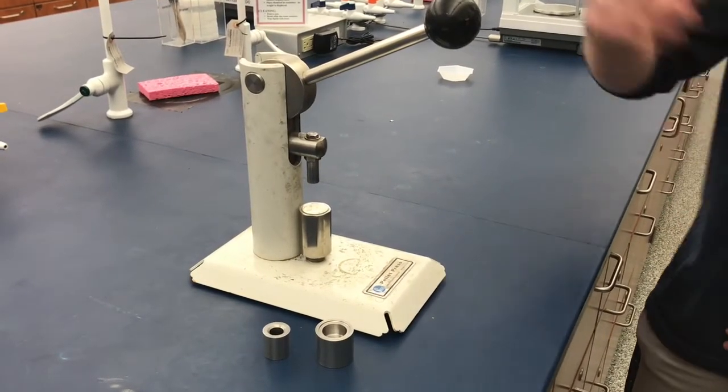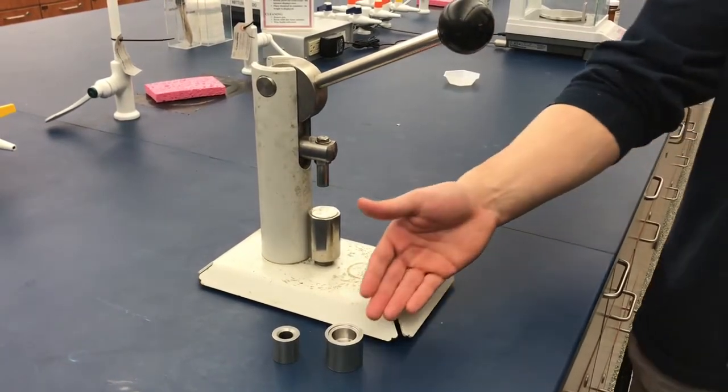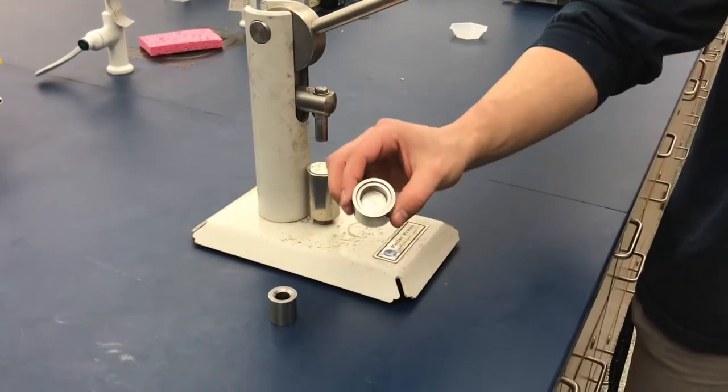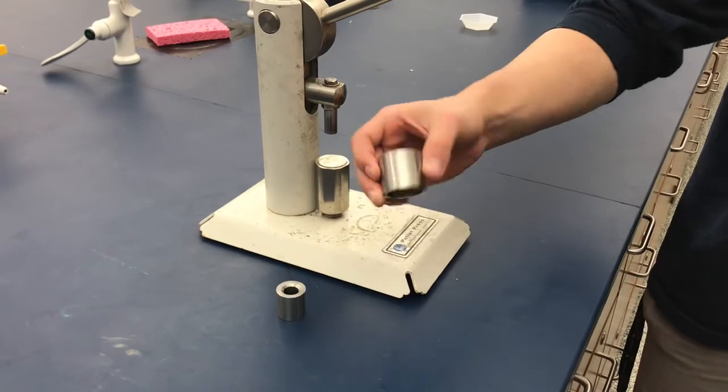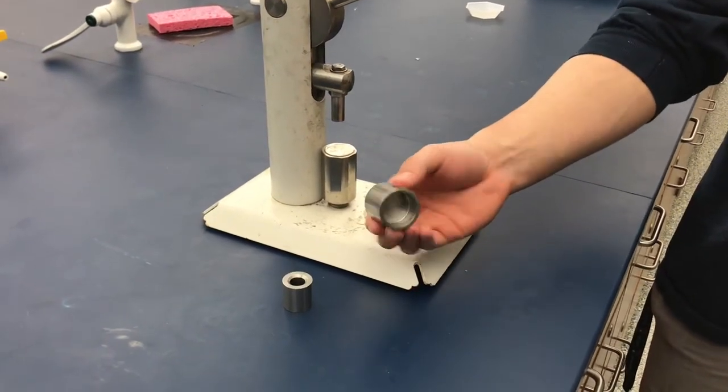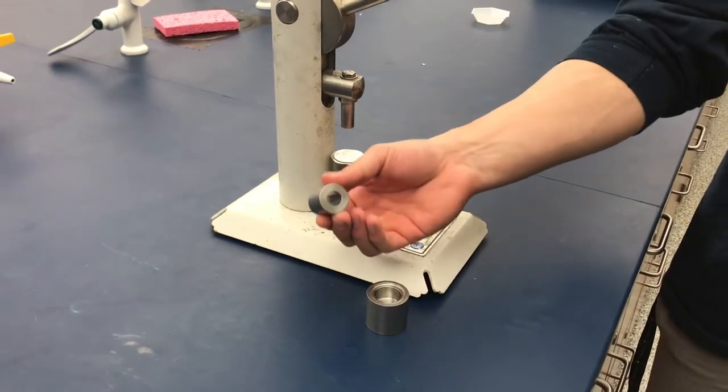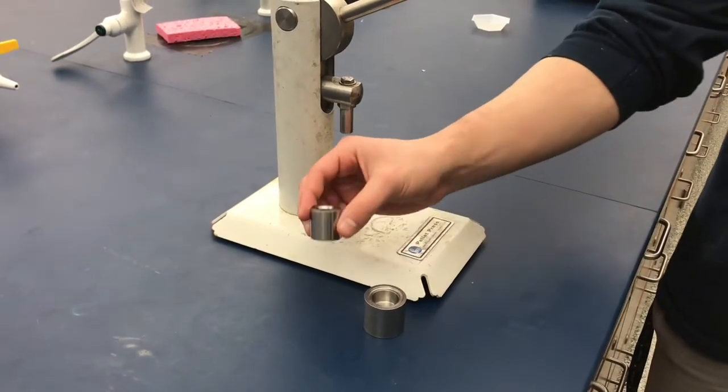When you arrive at the pellet press, you will see two circular tubes. Tube number one is the larger of the two, having a beveled edge on one side and a flat edge on the other. Tube number two looks similar, having both a beveled and a flat edge, however it is smaller than tube number one.